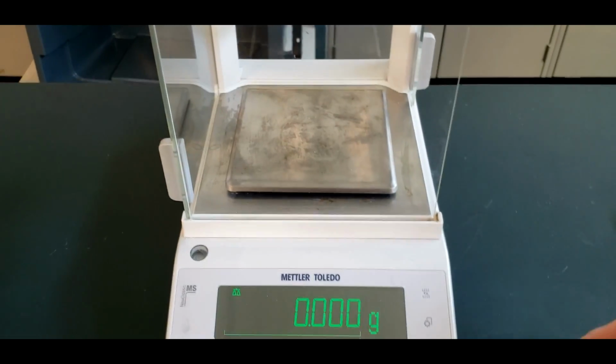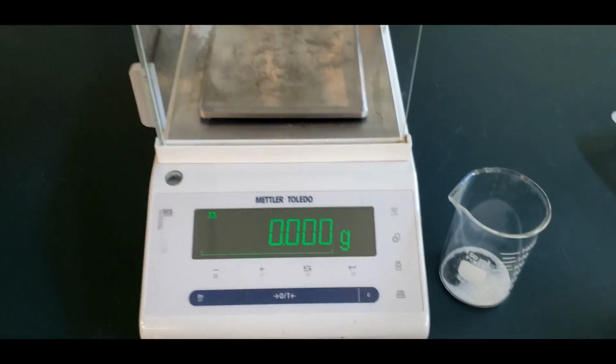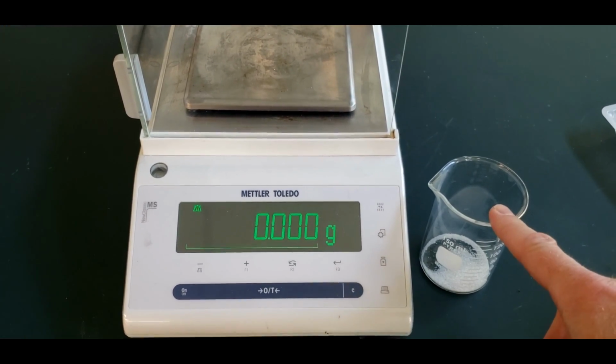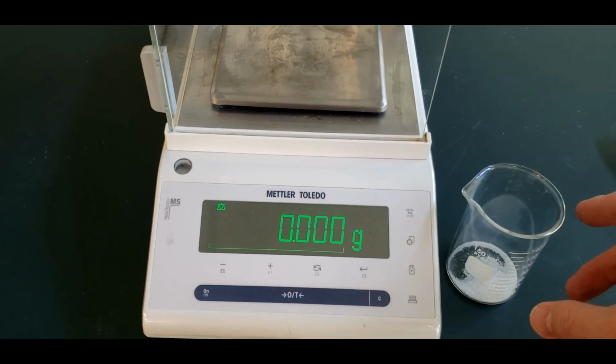We're going to weigh the beaker with the residue, they call it. This should be mostly just sand and salt. Might be a little bit of ammonium chloride in it.